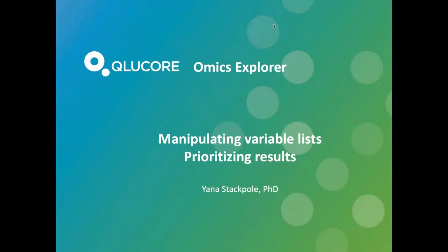Look, we look at the new complexity which is introduced by single cell data, multi-omics signatures. Here we will be talking about multi-gene signatures, but then next levels will be layers, multi-omics signatures, single cell. The way it is right now is easier to get started for those of you new to this area. So let me just jump. Okay.